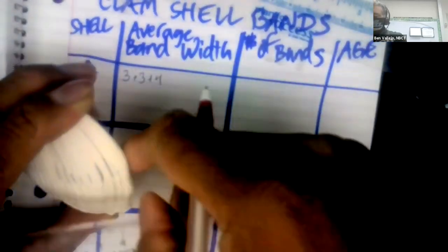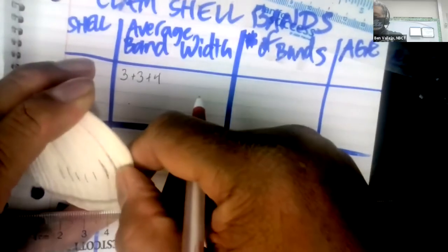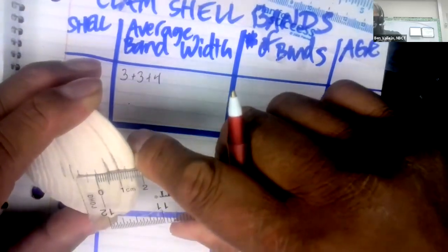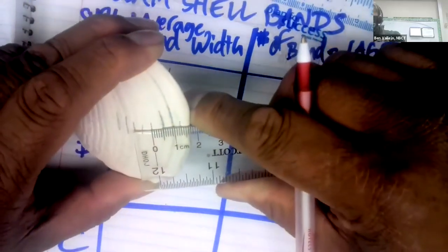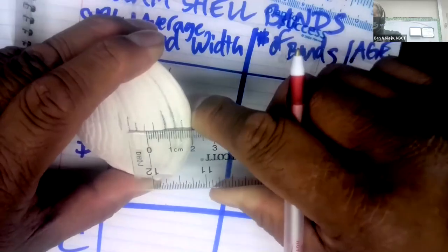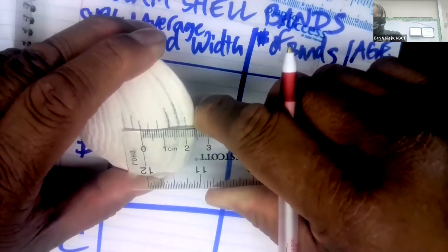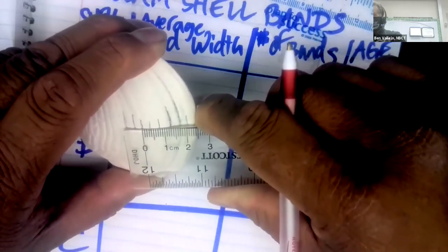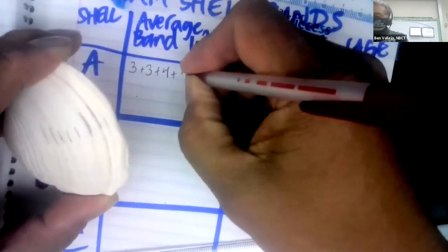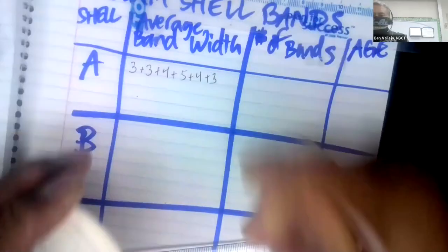That's a bigger one, right, the 1, 2, 3 right there. Here's another one. Maybe that one's even 5. We take a look at it. So I got 5 and a 4 and a 3.